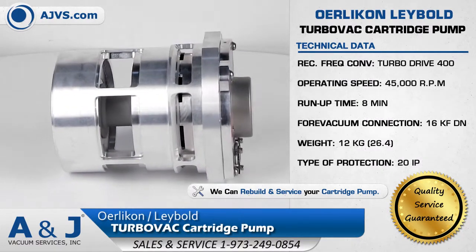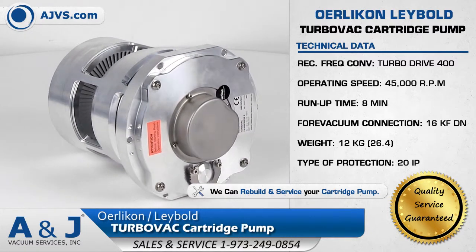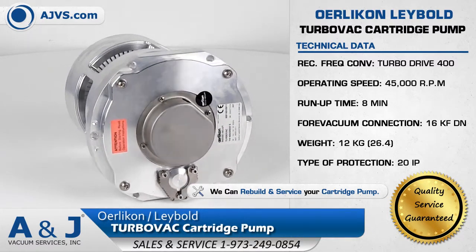The pumping speed and gas throughput of the TurboVac Cartridge Pumps are fine-tuned to attain higher detection sensitivities for instruments such as mass spectrometers.